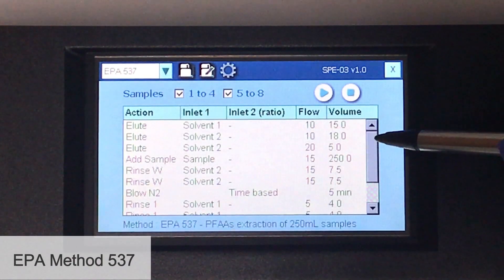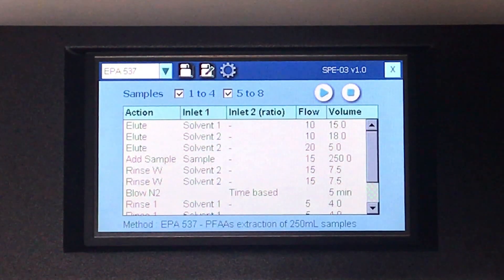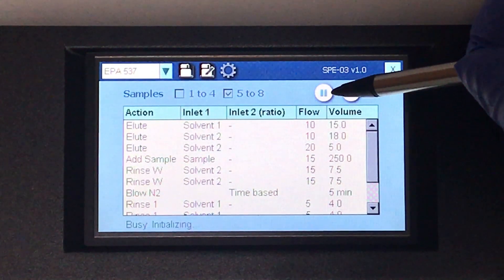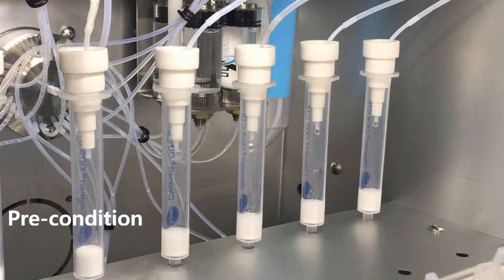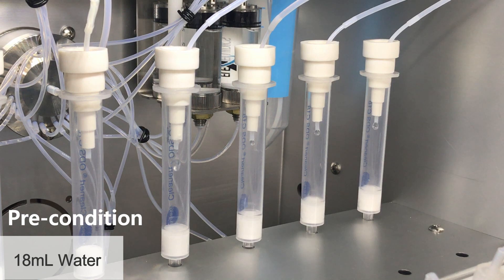Here is the pre-programmed EPA method 537. For this demonstration, we are going to run four samples that are dyed blue for better visualization. The system is now pre-conditioning the SPE columns with 15 millilitres of methanol, followed by 18 millilitres of reagent water at the set flow rates.